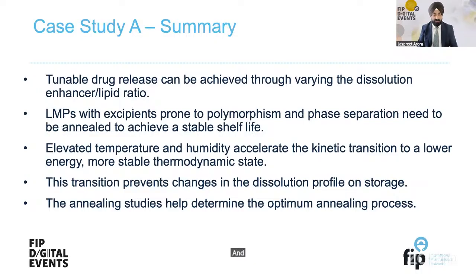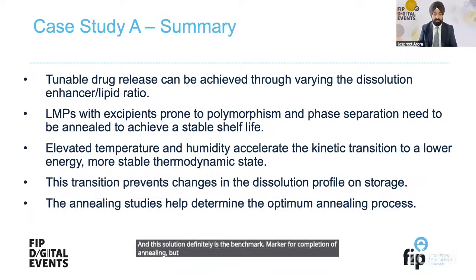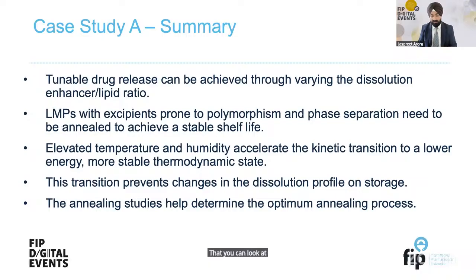And how you get there is elevated temperature and humidity conditions. Dissolution is definitely the benchmark marker for completion of annealing, but there are other properties based on the polymorphic changes that can help you use fewer dissolution tests to figure out when annealing is complete.